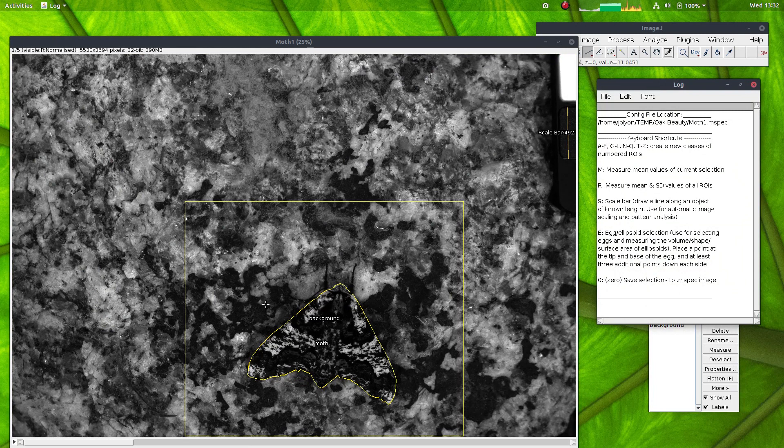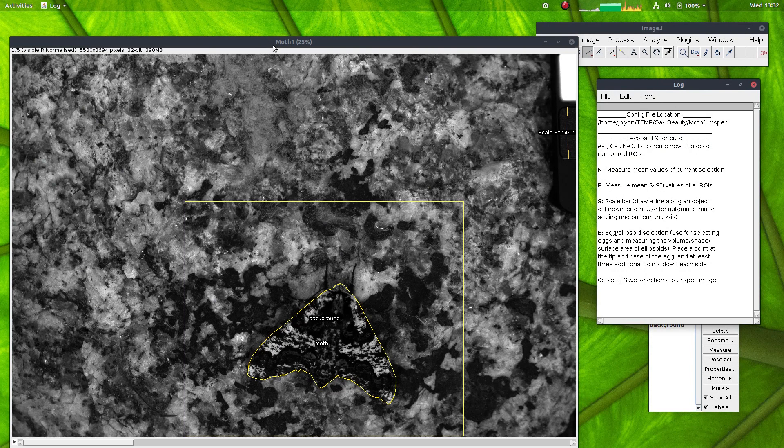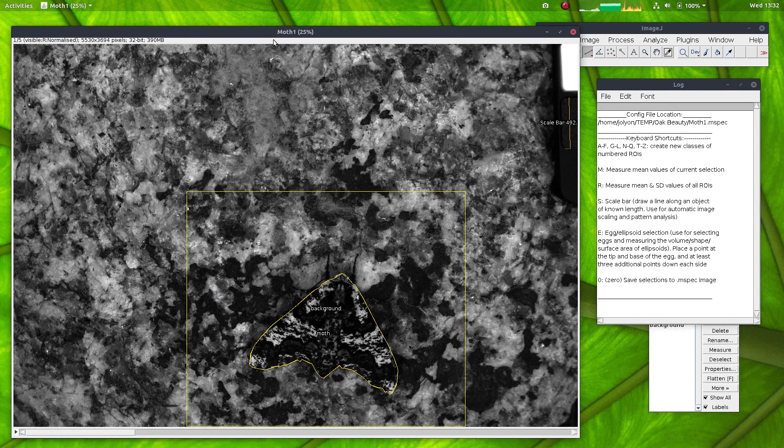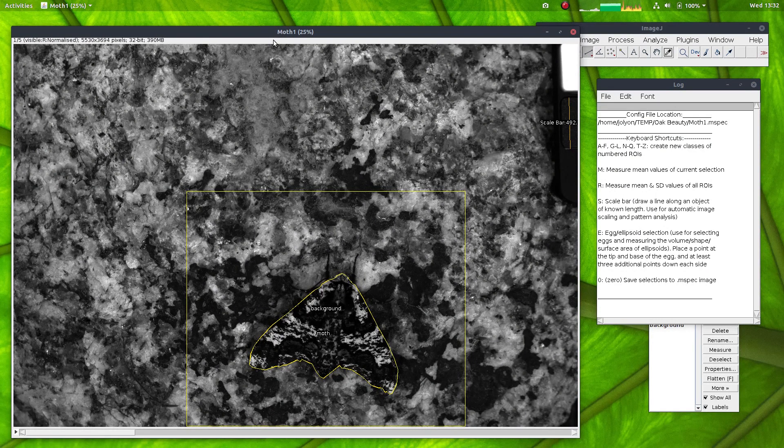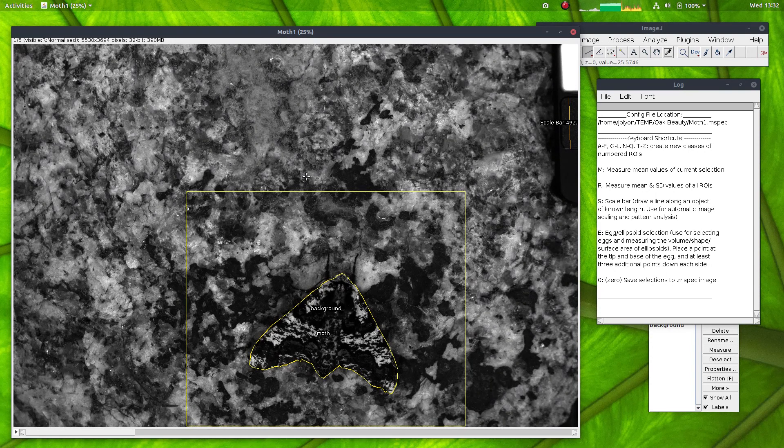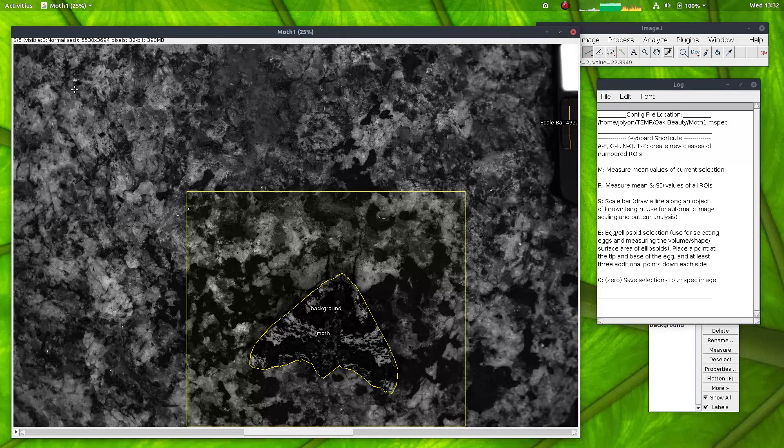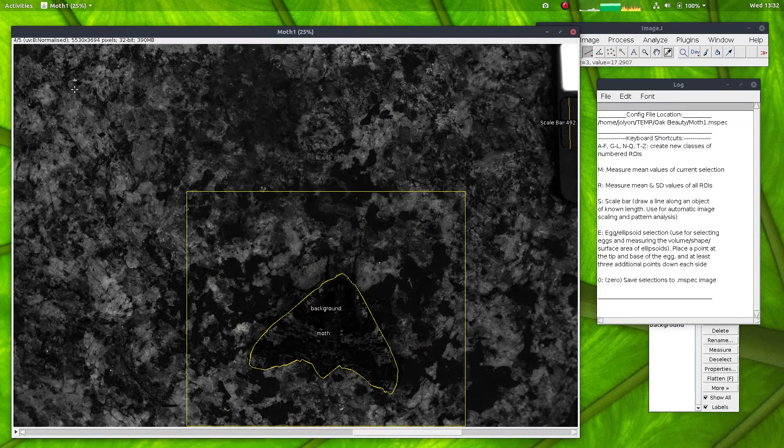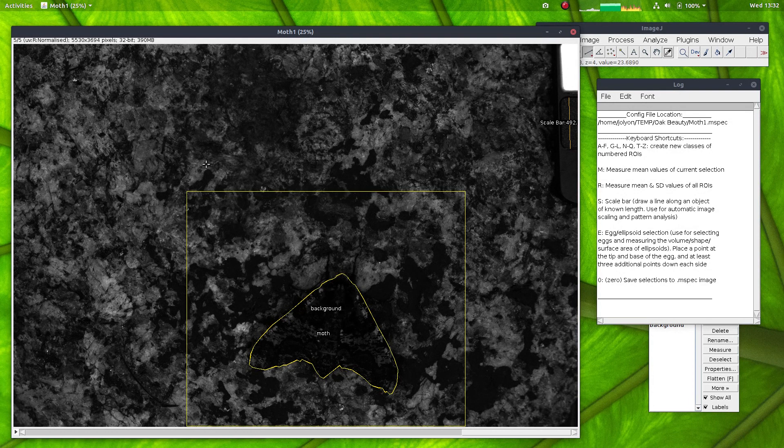This image of an oak beauty moth was taken with a camera that's sensitive to the human visible spectrum as well as the ultraviolet spectrum. But these modeling tools work with a standard visible only camera as well. So here we have the visible red, green and blue channel, plus the ultraviolet, blue and red channels.